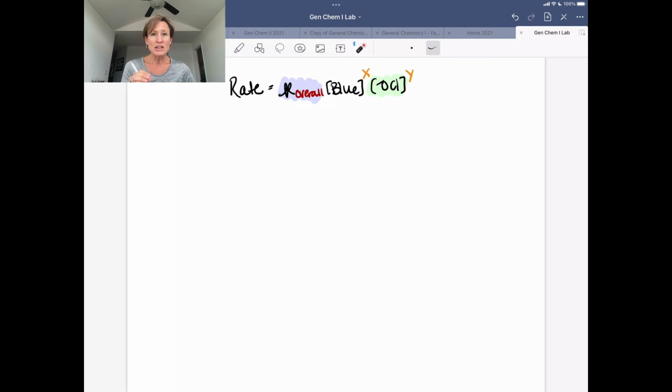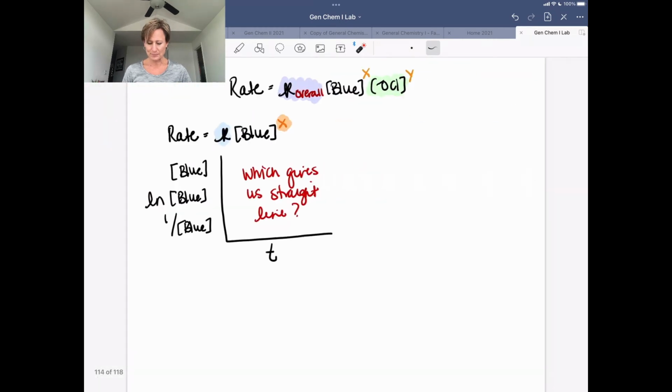Now, we did something unique with this experiment, is that we used graphing experimental data as a way to determine our reaction orders and then our overall rate constant. So what I've highlighted here, these are sort of the money pieces for a rate law. Those are the things that start out generically, but then you want to determine. Now, some other things that we used here is we used varying concentrations of our bleach to be able to do this experiment. So let's just go through one last time here and kind of summarize all this up so that hopefully this makes sense with what you did today.